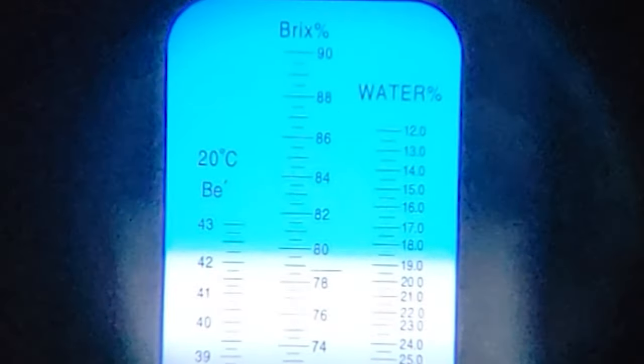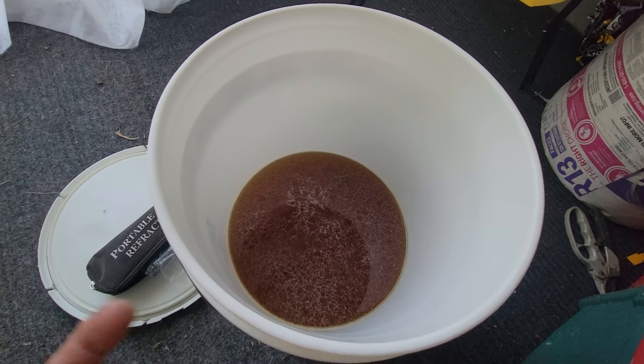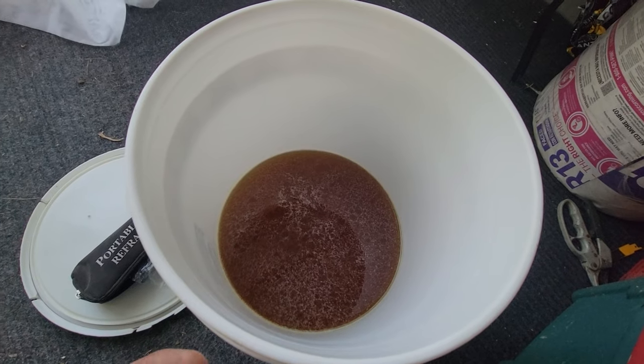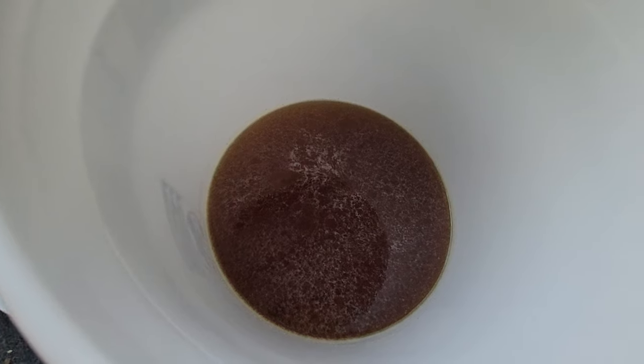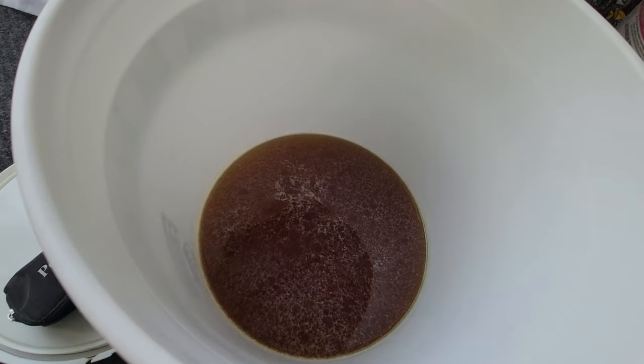And now we'll look through it again and see what we get as far as our reading. So from what I'm seeing, it's about 18.5, almost 19%. So what I want to do is let this moisture get out of this honey. And a way to do that is just take the bucket off, take it in the house while the air conditioner's running, or if you've got a dehumidifier, it's going to do the same thing. It's going to suck the moisture out of here and lower the moisture content.